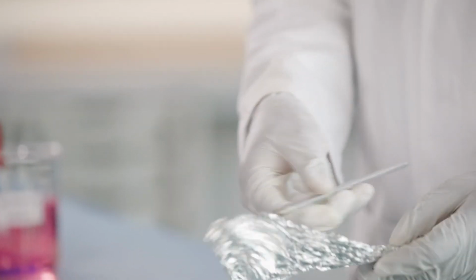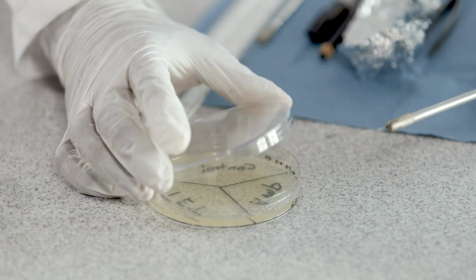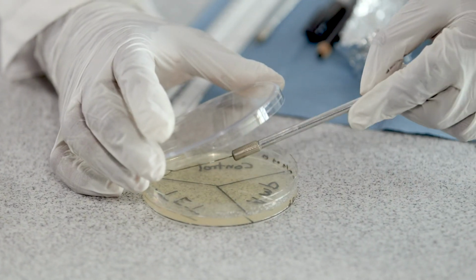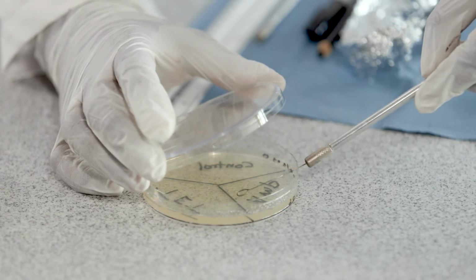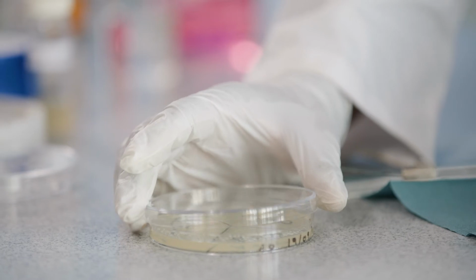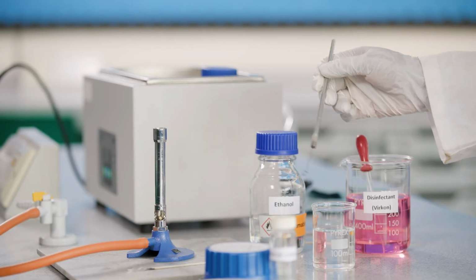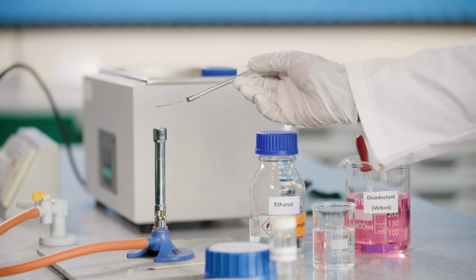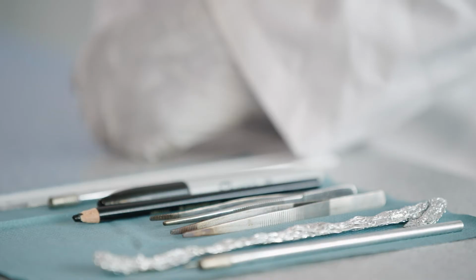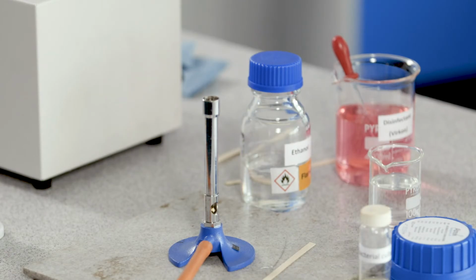Unwrap the spreader, and lifting the dish lid as little as possible, gently spread the culture drops across the agar using a back and forward motion with the spreader. Replace the dish lid and place the spreader in disinfectant. I am now going to demonstrate how to successfully add antibiotic discs.